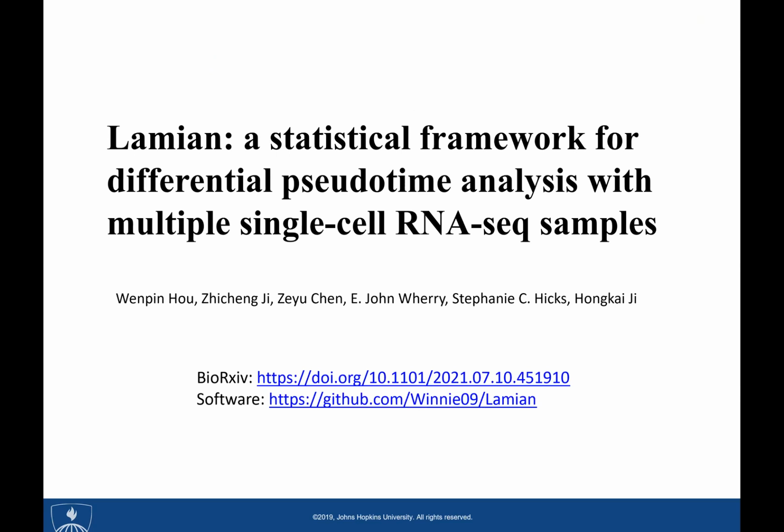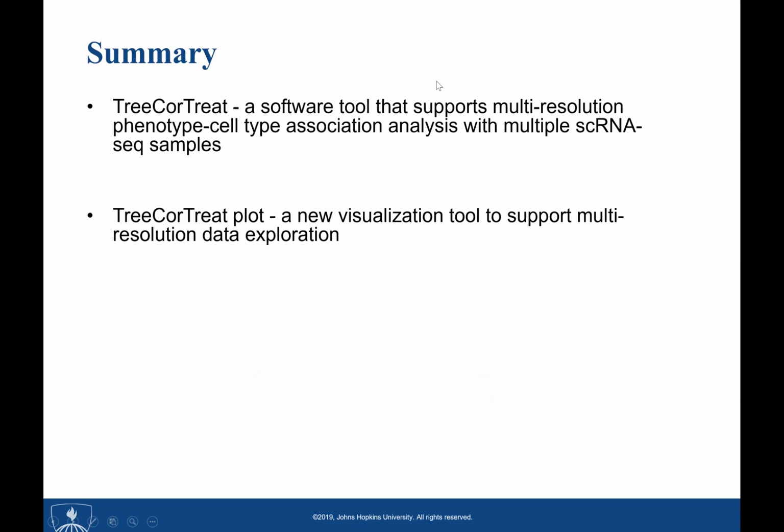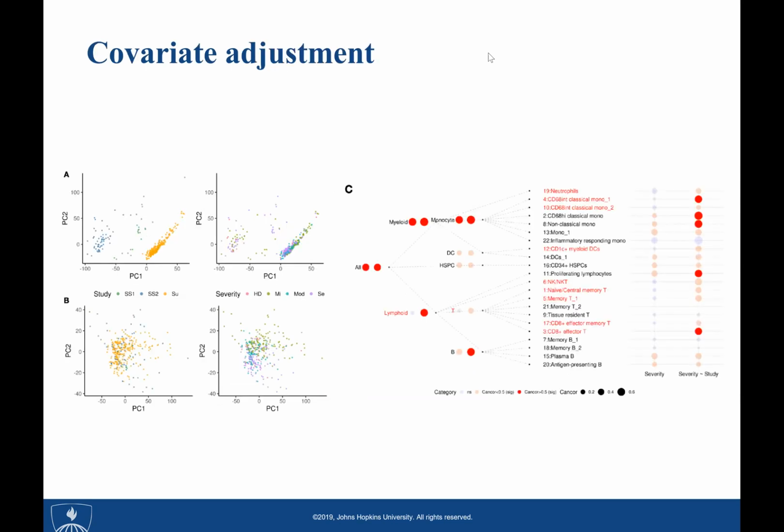All right. Dr. Ji, I hate to interrupt, but because we have a very enthusiastic audience, we have several questions, I think, pivoting around how we integrate multiple data sets. I think you addressed some part of it. If we have the freedom to do batch correction, but if I'm getting this correctly, upon integrating multiple data sets we may or may not correct for batch effects. Do we perform any, for example, Harmony or several other data integration methods to combine the data? But if I'm understanding this correctly, after doing the analysis, we can also visualize the significant result back in each individual study. Is that correct? But we want to do some data integration together in the first place.